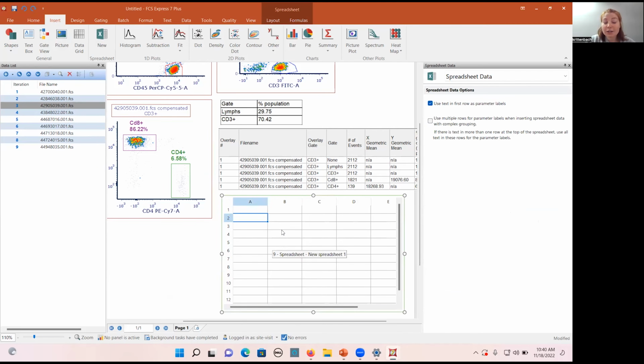Okay, so now this is our integrated spreadsheet, and you can probably see that it looks like Excel, and it actually functions like Excel also. So you could just type in values here in the cells. So if we wanted to do a formula here, if we wanted to enter 3 and 2, and then we want to multiply them together, we could reference those cells just like we would in Excel and do that calculation.